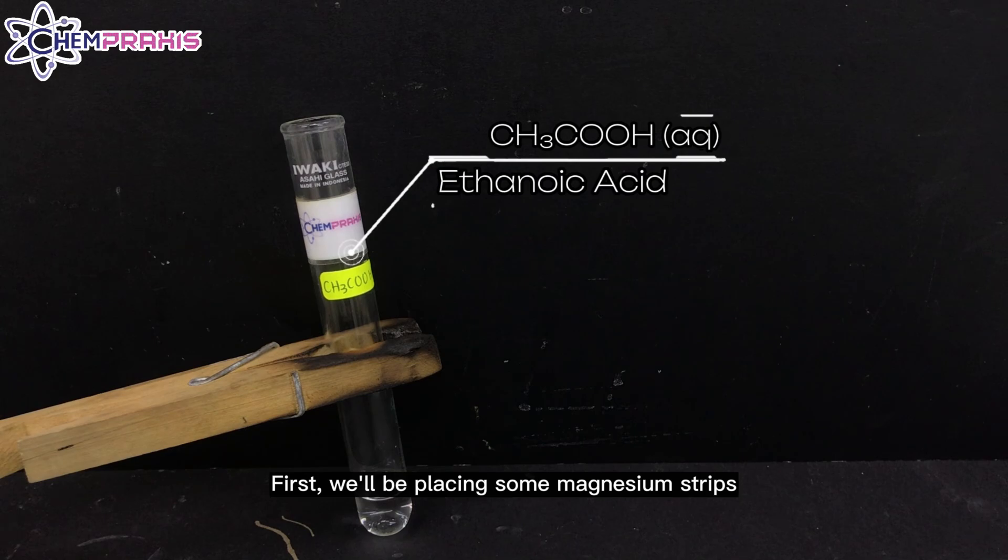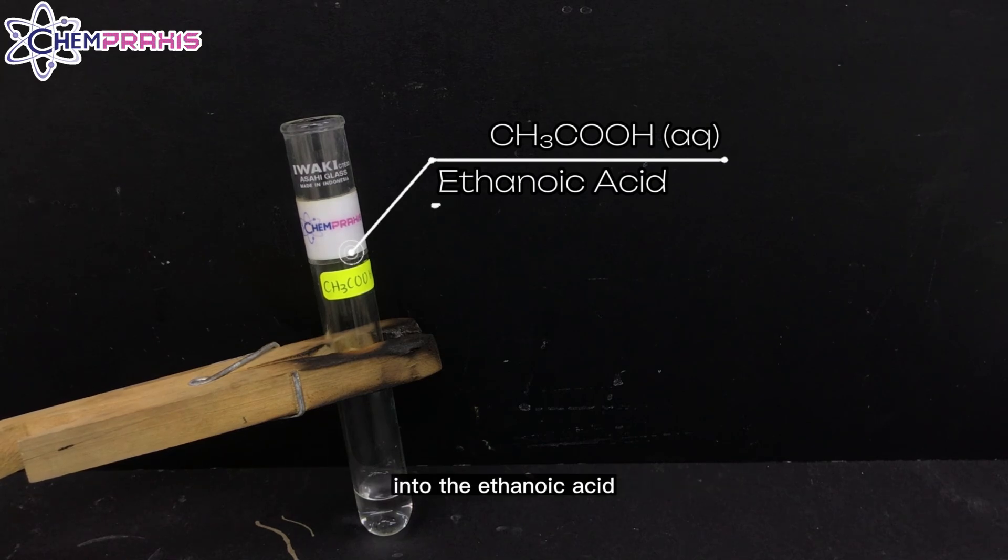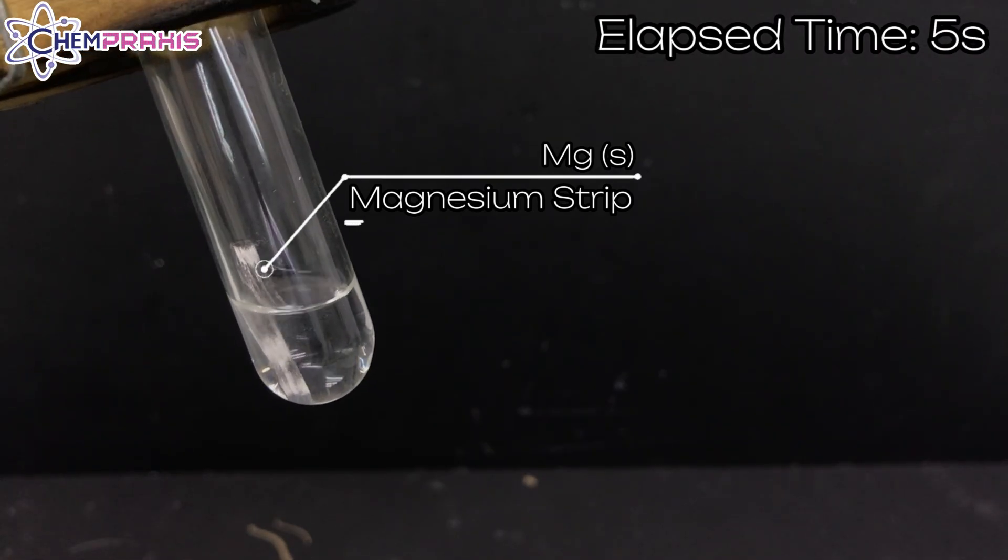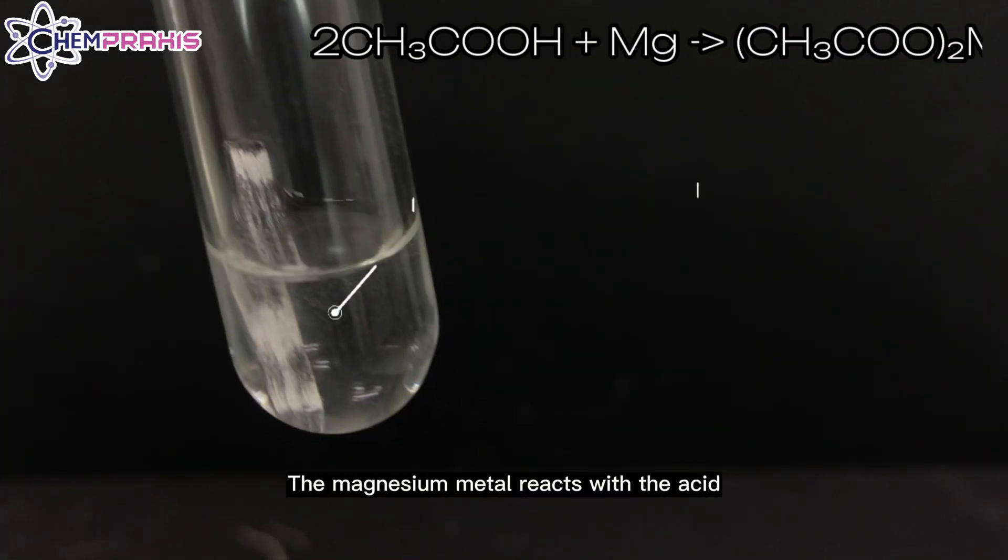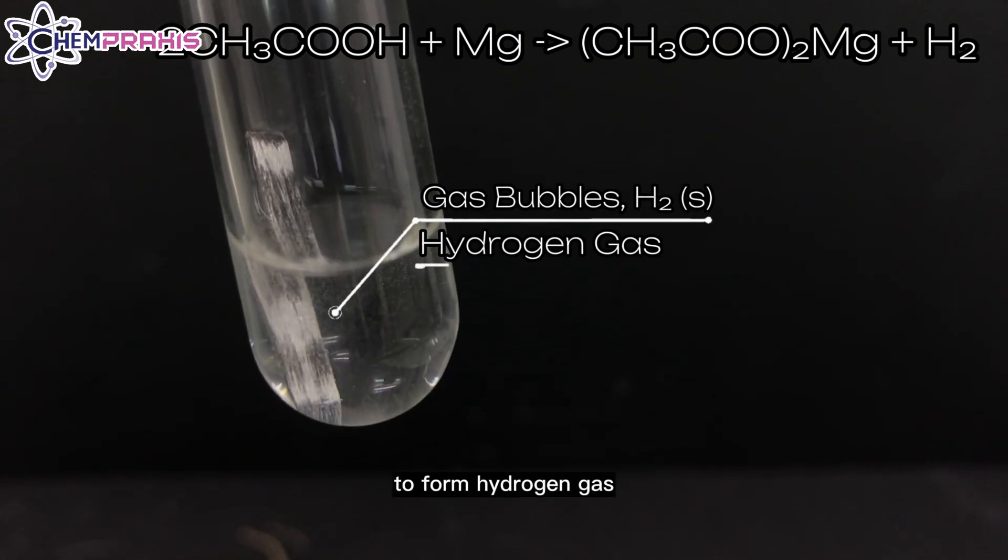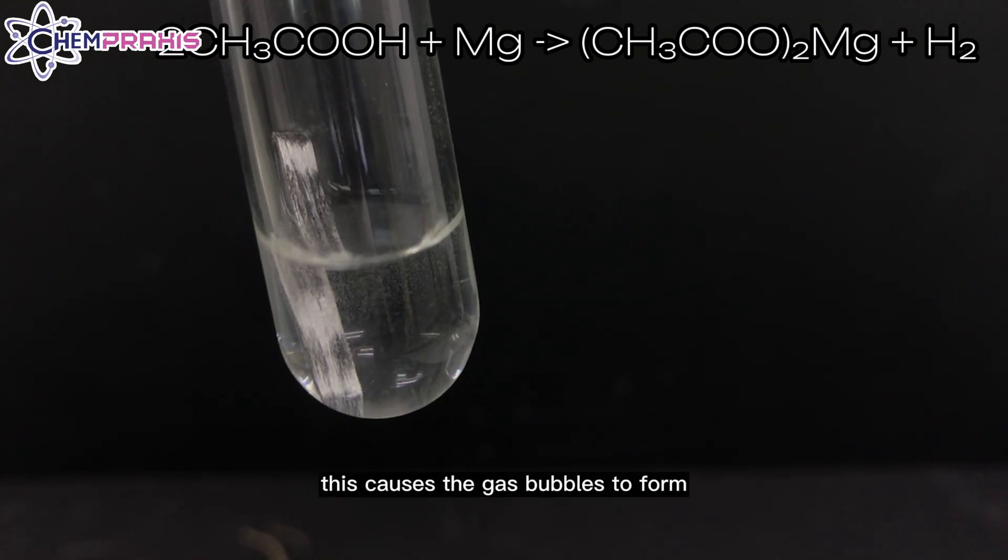First, we'll be placing some magnesium strips into the ethanoic acid. Gas bubbles are being produced. The magnesium metal reacts with the acid to form hydrogen gas. This causes the gas bubbles to form.